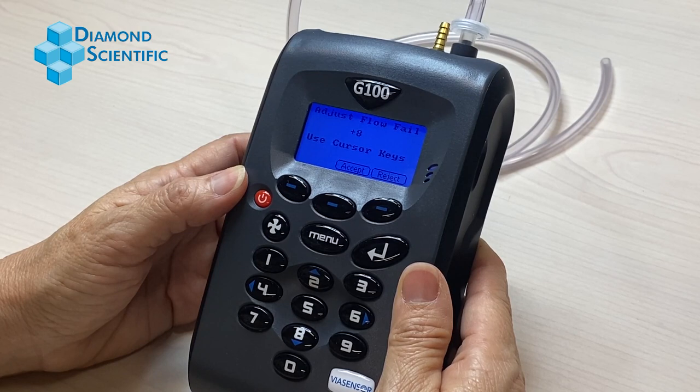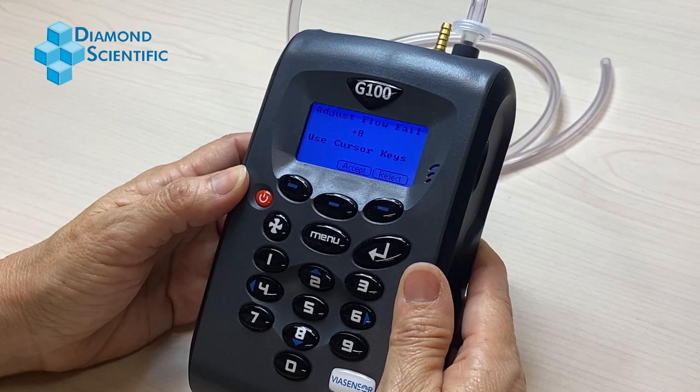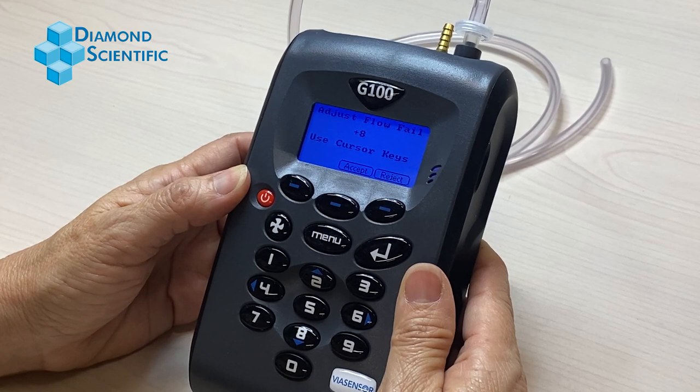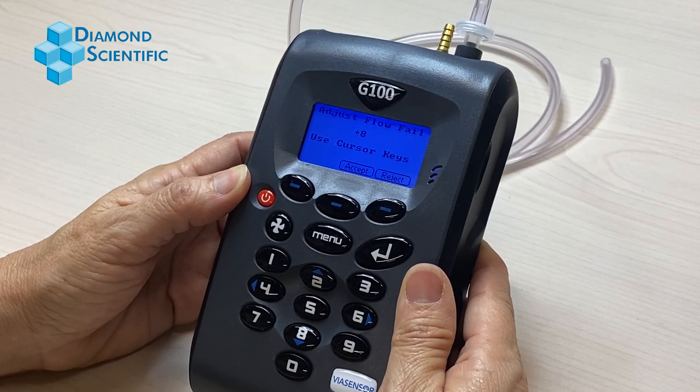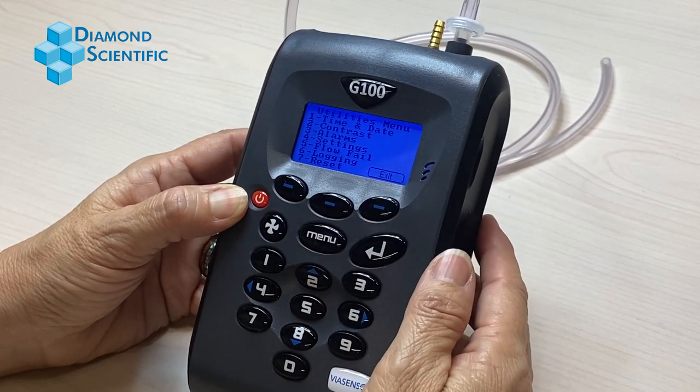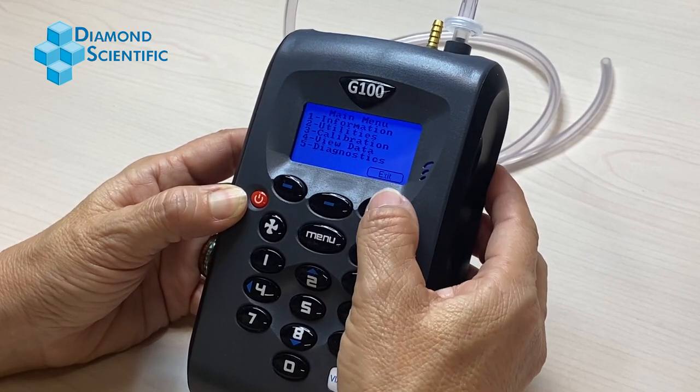For a flow fail event, adjust one or two points higher at a time. The adjustment setting ranges from negative 16 at a minimum to a positive 16 maximum. Press the accept key.